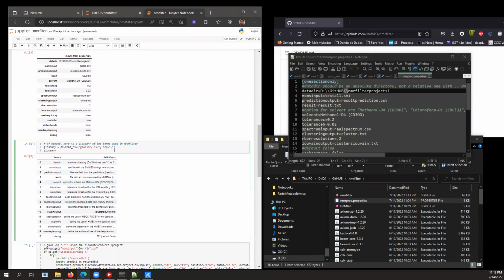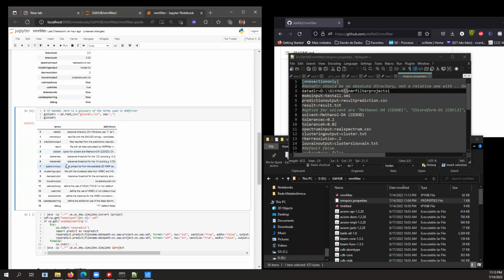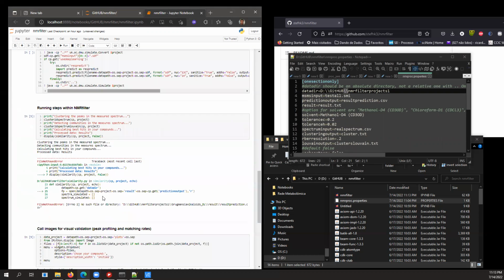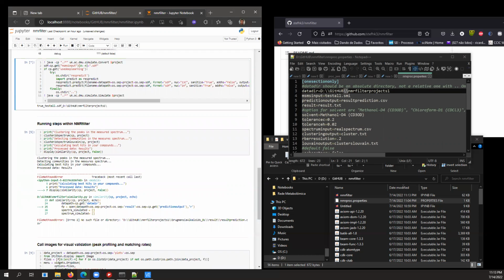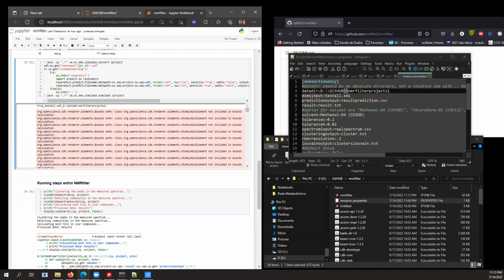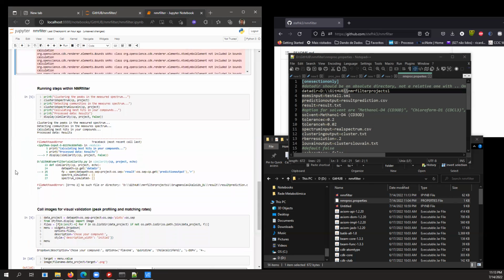Okay, in here, there's just another cell calling up some definitions for these parameters that we use. You can run that, and it will bring the definitions, and this will do the part of the predictions. Okay, we wait a moment. I'm not speeding up this video or anything, just for you to see how quick it is. Okay. This is just some warnings about the simulation.